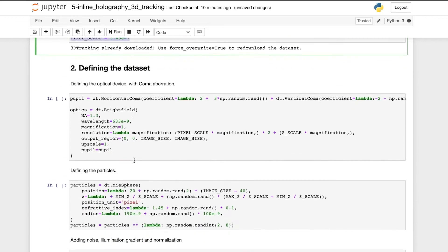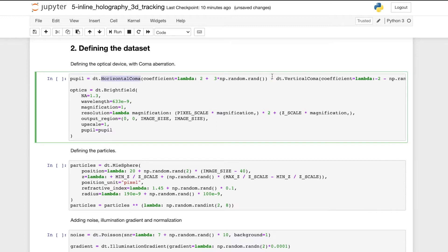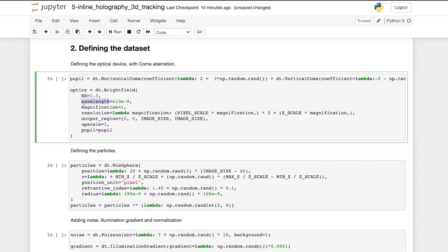Then, we define the dataset. The training set consists of simulated images. First, we define the optical device, where we approximate the experimental point spread function by adding coma aberrations with random strength. We image the particle with a brightfield microscope with numerical aperture of 1.3 and illuminating laser wavelength of 633 nm to simulate an inline holographic microscope. We also define the resolution and magnification of the microscope.